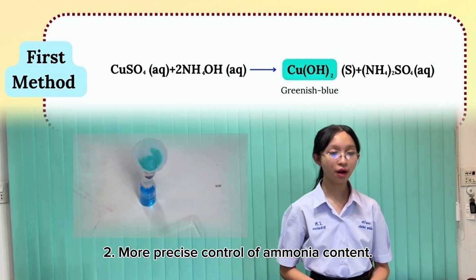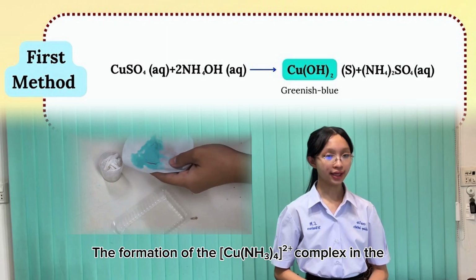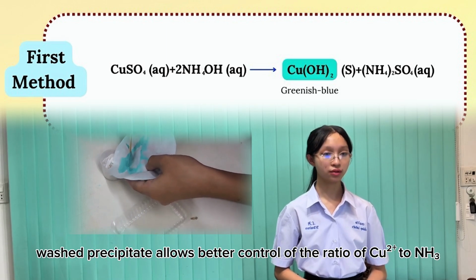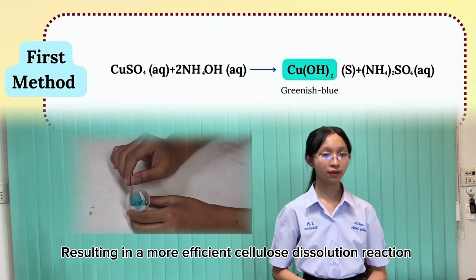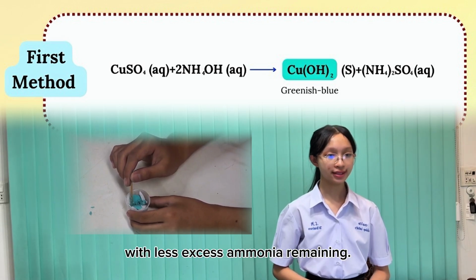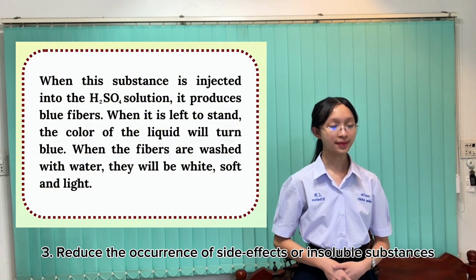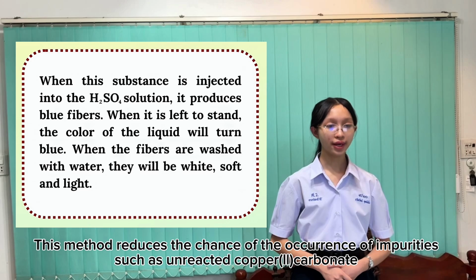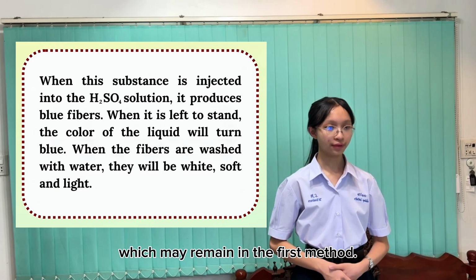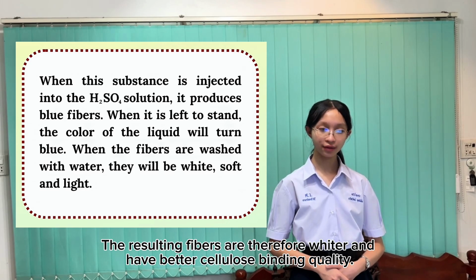2. More precise control of ammonia content. The formation of the tetraamine copper(II) ion complex in the washed precipitate allows better control of the ratio of copper(II) ion to ammonia, resulting in a more efficient cellulose dissolution reaction with less excess ammonia remaining. 3. Reduce the occurrence of side reactions or insoluble substances. This method reduces the chance of impurities such as unreacted copper carbonate, which may remain in the second method. The resulting fibers are therefore whiter and have better cellulose binding quality.